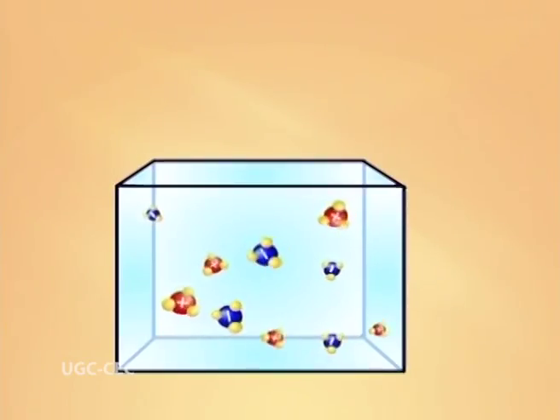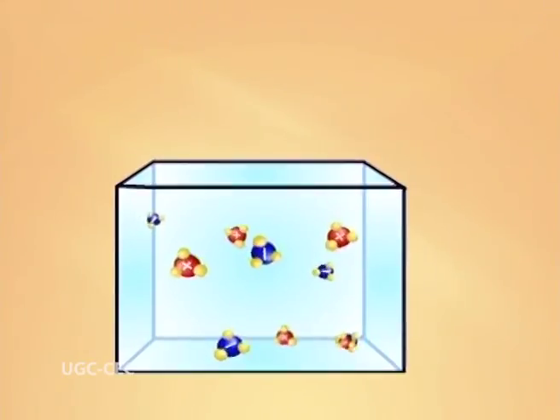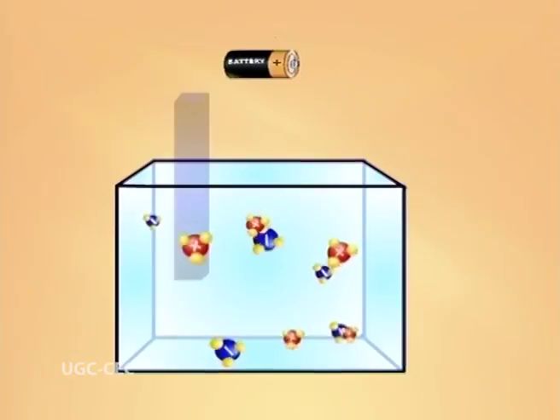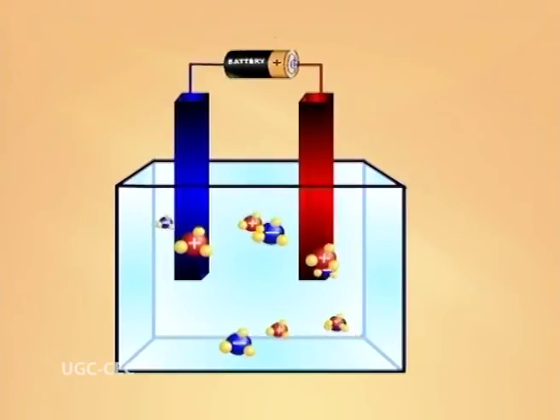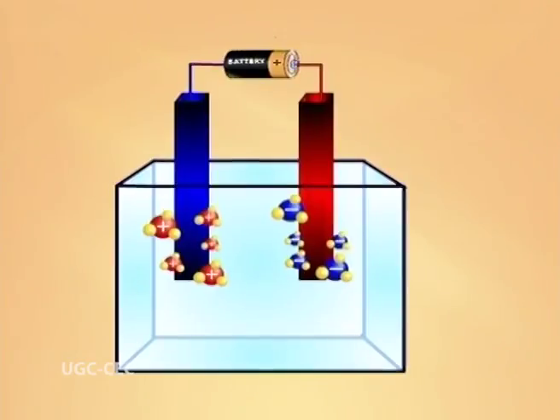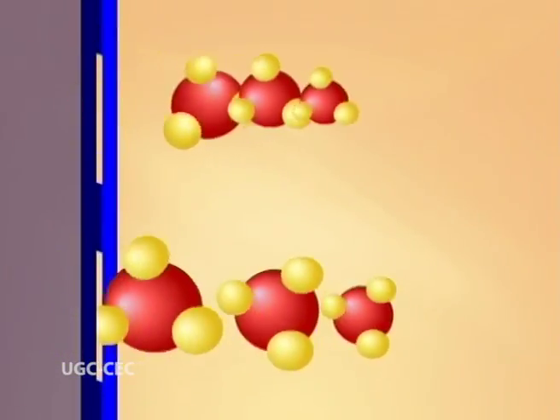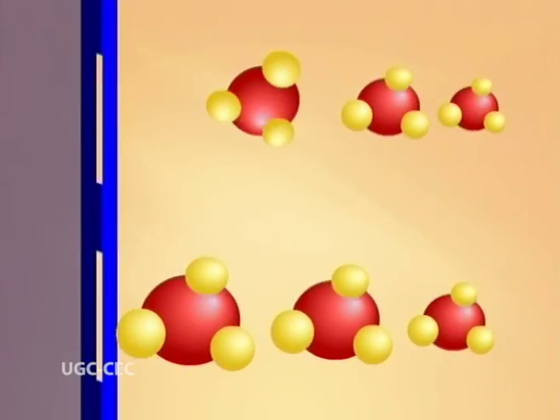Elaborating the principle, it says that every molecule has a charge. It may be positive or negative, and when the current is passed, this charge gets converted into ions and hence it migrates towards the cathode or anode depending on the charges. Now the second point is that the molecular weight also plays an important role. The molecular weight is inversely proportional to the migration. If the molecular weight is high, then the migration would be low, and if the molecular weight is low, then the migration would be faster.